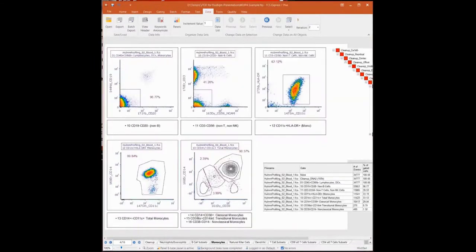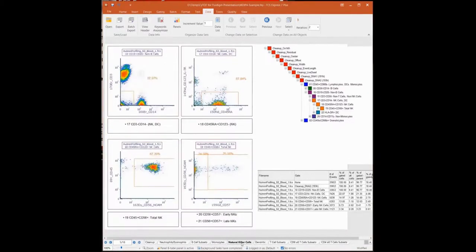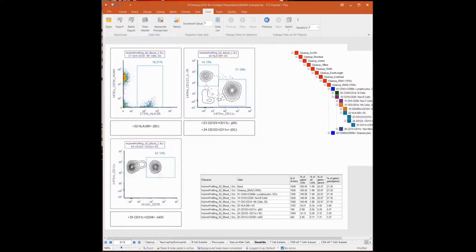These are all your primary flow plots that you're used to from your software. And you can do all the types of plotting, all the types of gating, density plots, contour plots, histograms, backgating, everything you're used to for primary flow analysis you can do in FCS Express. So I'm not going to focus on that for now. I want to show you some of the novel features.